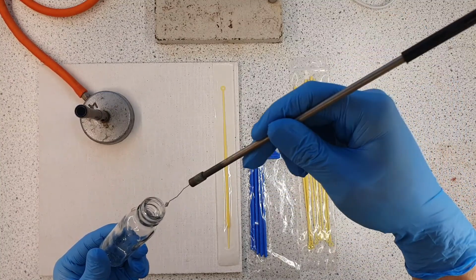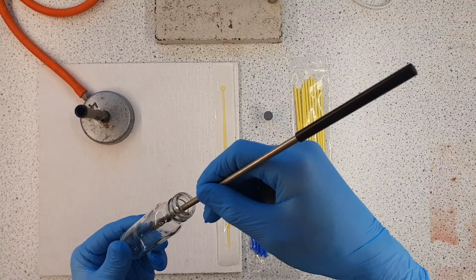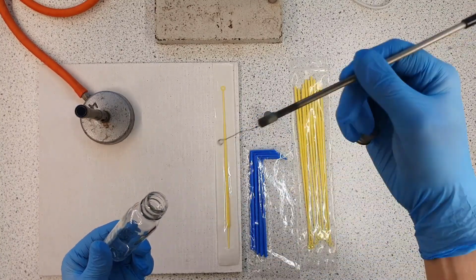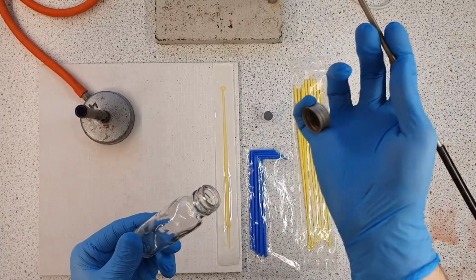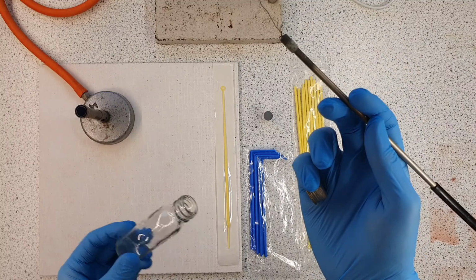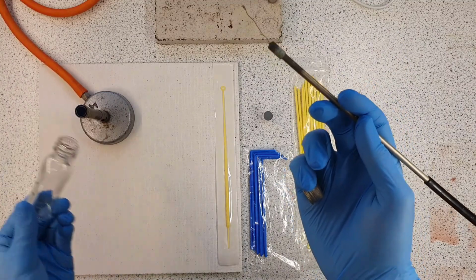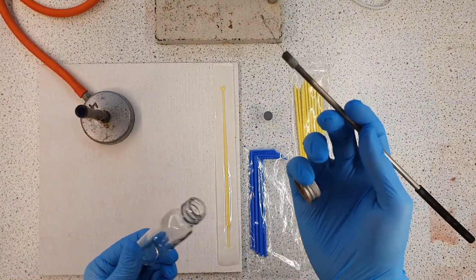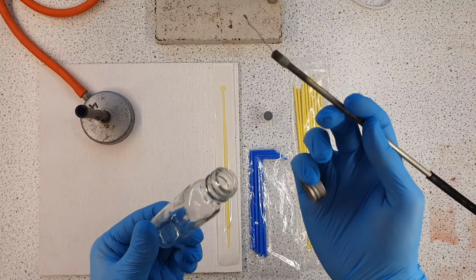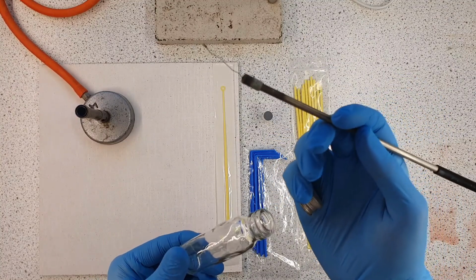So then we would take our piece of equipment and do whatever we need to do inside. So we collect our liquid sample or solid sample. And then before we put the lid back on, as we would with our pinky finger, we would flame the neck of the bottle again, just in case we've introduced any particulates or contaminants. Obviously, don't start flaming the lid, otherwise you'll burn yourself. And also, it's wise to let this cool down for a bit, just to make sure it's not going to burn your finger, especially if you're wearing gloves.